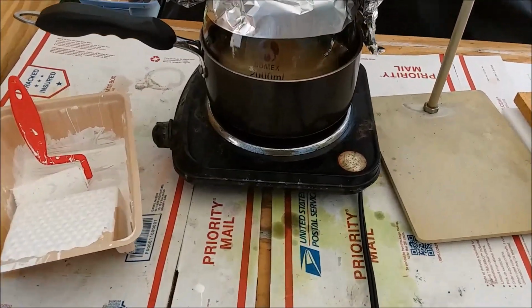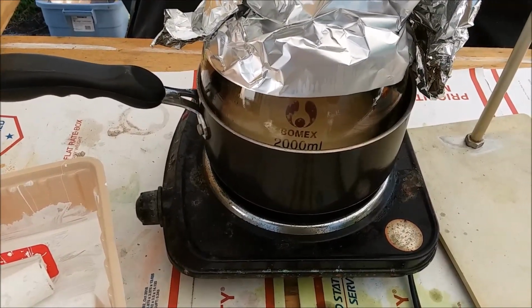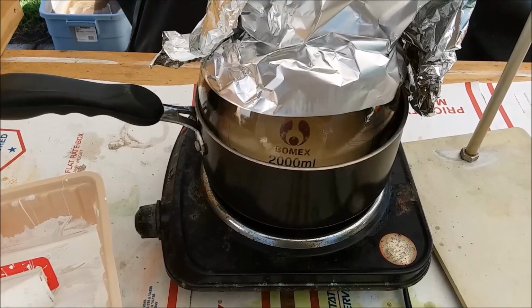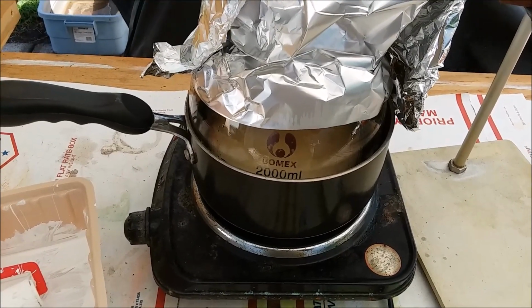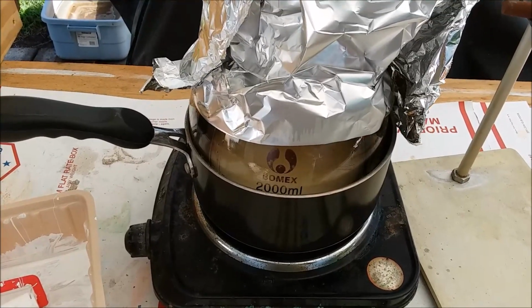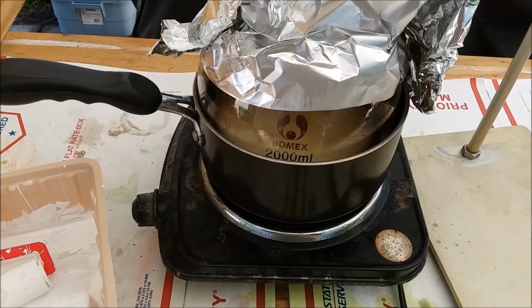Yeah, the foaming has subsided. That's weird how that happens. It's like it gets close to the end of the reaction and then it just takes off. It's like the finale at a fireworks display. It sort of goes along at a steady pace, and then there's a big, massive explosion there at the end where they give it all they've got. It's kind of what happens with this reaction.